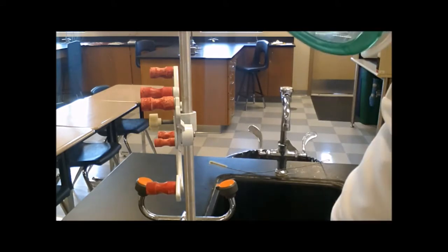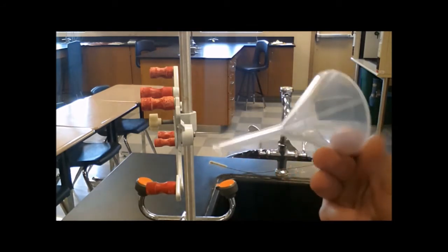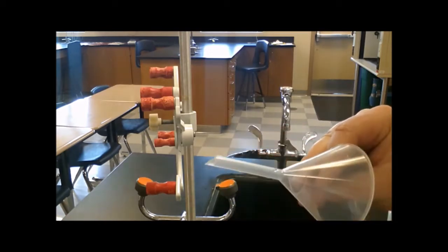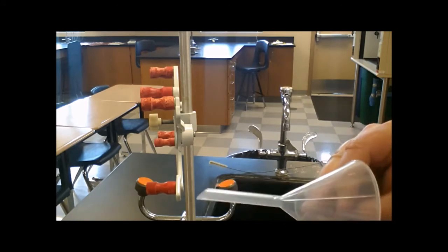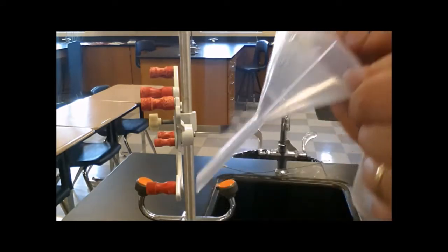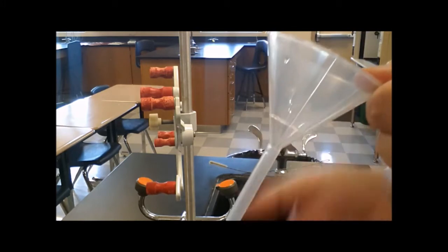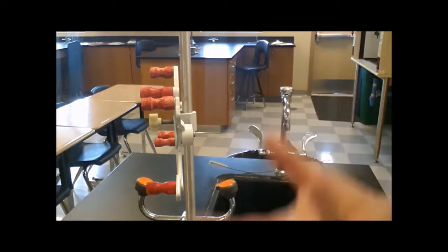You're going to need a funnel. You want the liquids funnel, not the solids funnel. You can tell the liquids funnel because it's got the bottom chopped off at an angle. The solids funnel has the bottom chopped off flat. Chopped off at an angle allows the liquid to drain out the funnel. If you use a solids funnel, the liquid won't actually drain out the bottom. You'll pour too much into the top and it'll overflow out the top of the funnel.